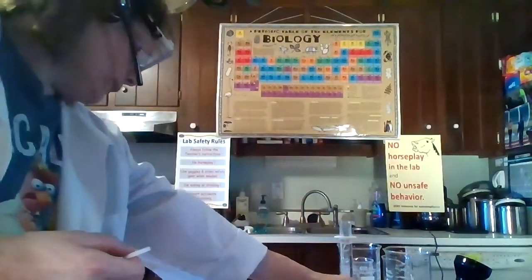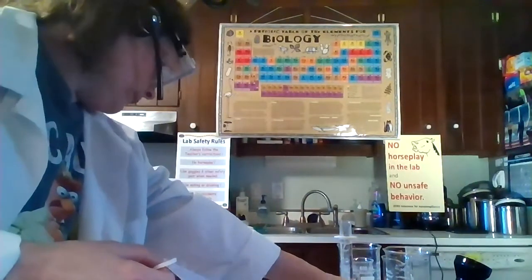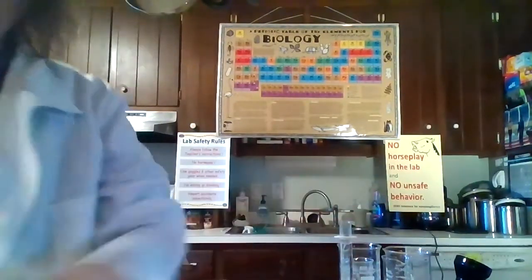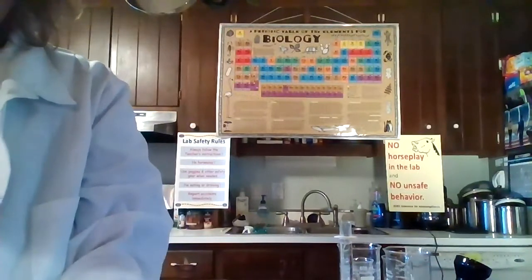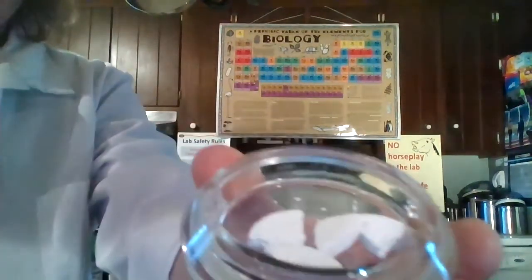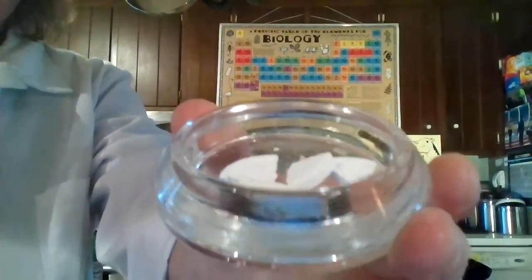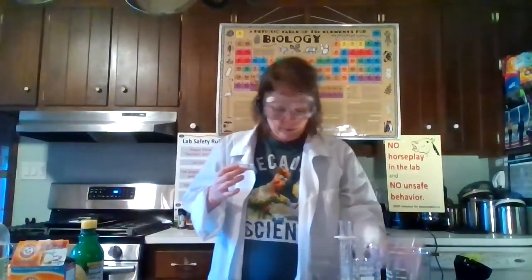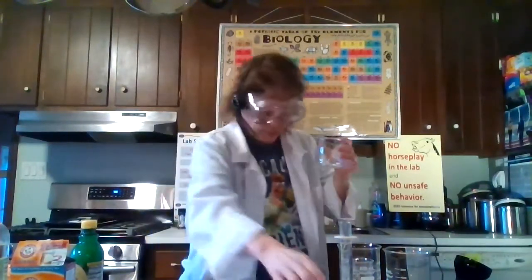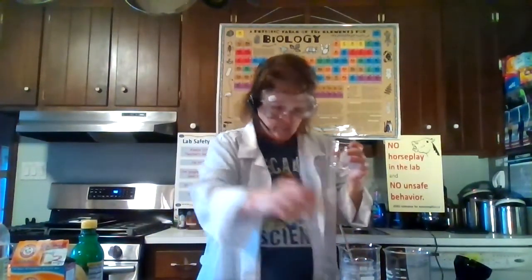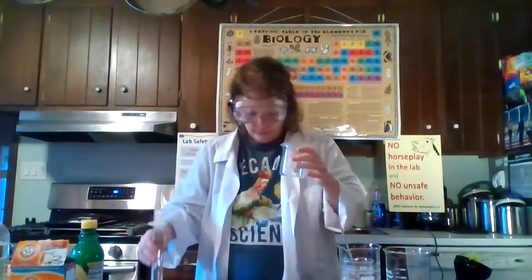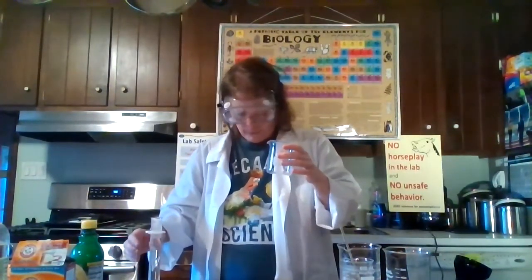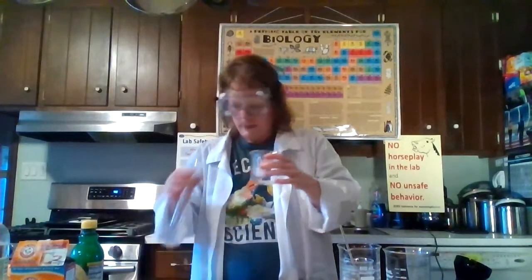It says that I am to break it into pieces. So I'm going to put it in this watch glass here — as you can see, I have broken it into pieces. Our next step says that we need to put it in a cup; I'm going to use a beaker. You can see our beaker right here. I'll dump the pieces in, and then I am going to take the 50 milliliters of water that I've already measured out and add those together.